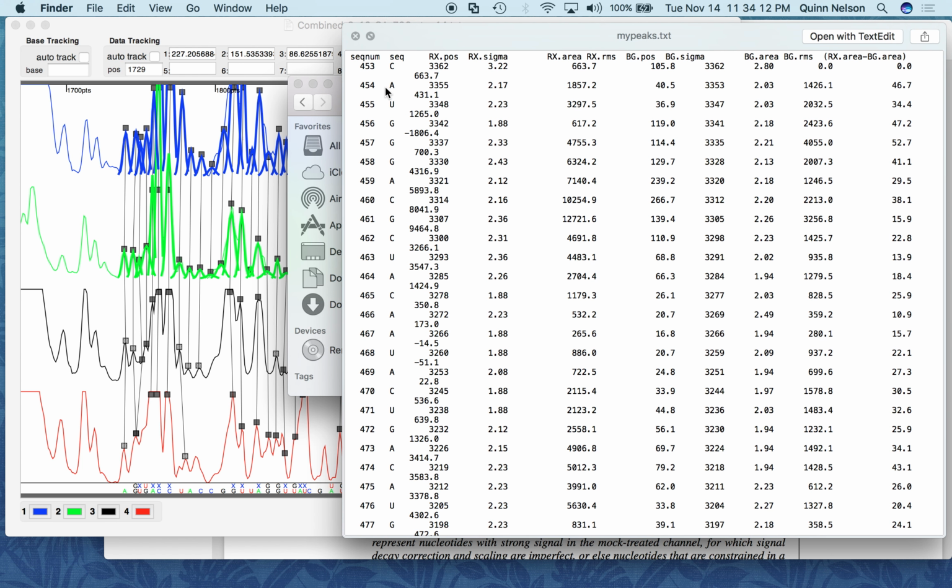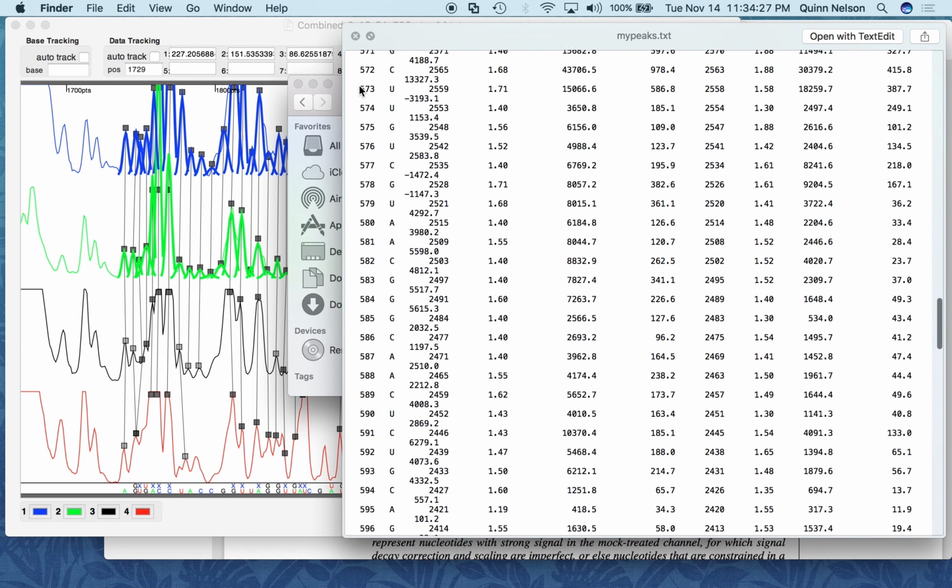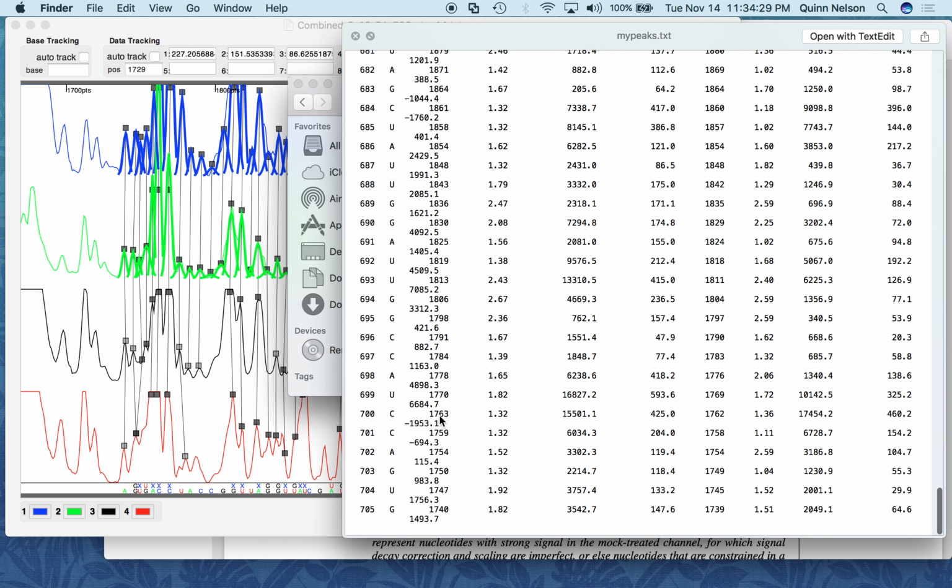And I'm happy with this, actually, a little bit more than the last read. Because I gave it a bigger sequence window, and it still stuck out here and positioned at 453, that makes me a little bit more confident that this is the sequence that this data represents. And honestly, the 705 is more believable because I moved a little bit further back in the ShapeFinder from the ribozyme, those big peaks. We didn't start so close to them. So it's understandable that it's 705. And I'm happy with this.